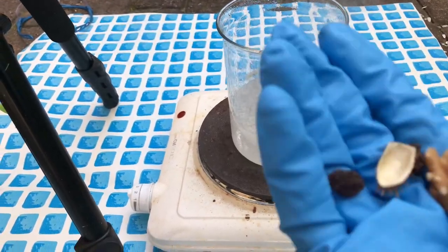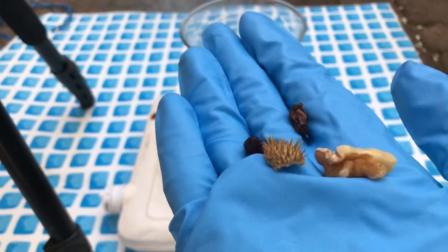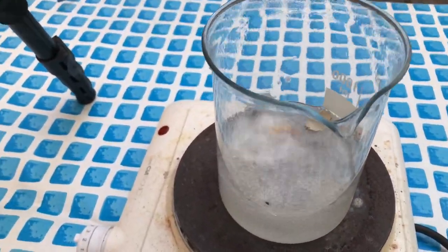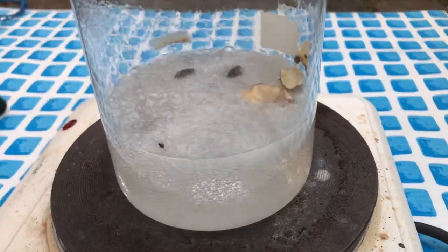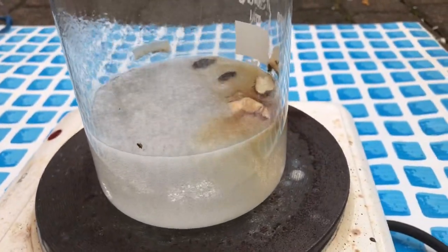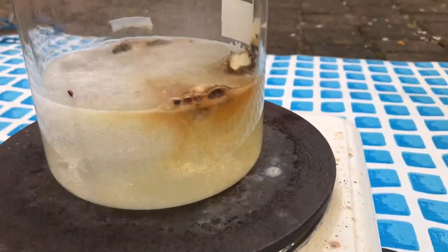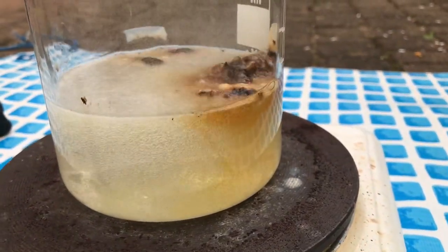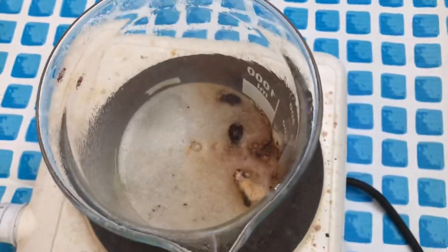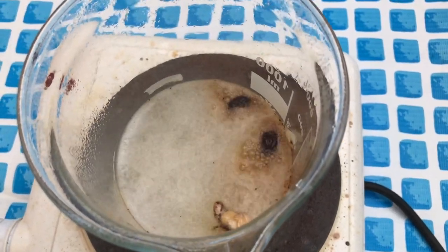We've also got two raisins, a walnut, and a piece of seed pod — let's throw them in and see what happens. Raisins float in concentrated sulfuric acid because sulfuric acid has a really high density. The solution turns brown and the brown stuff immediately becomes clear again. All of the material gets oxidized to carbon dioxide and water.